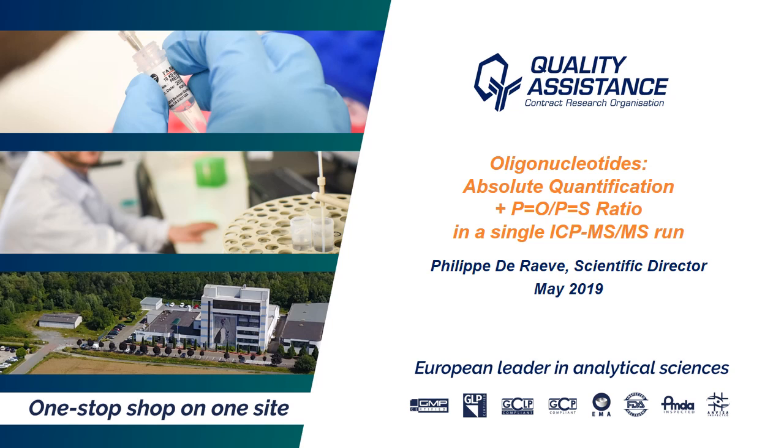Welcome to the webcast dedicated to the absolute quantification of oligonucleotides and the POPS ratio determination for a phosphorothioate using ICP-MS.